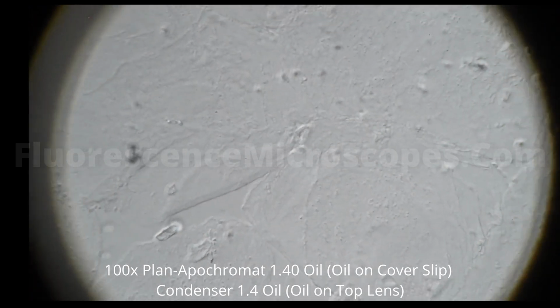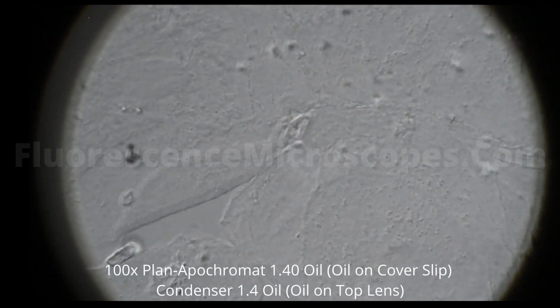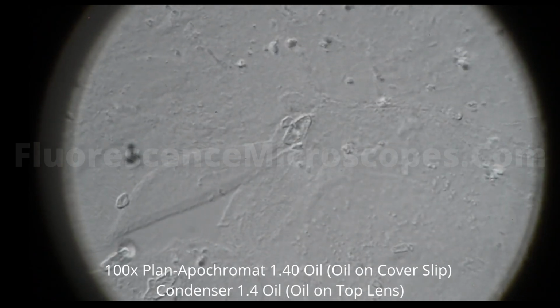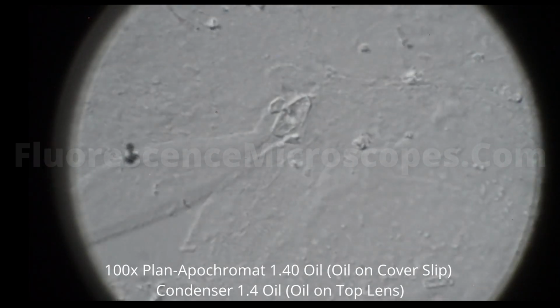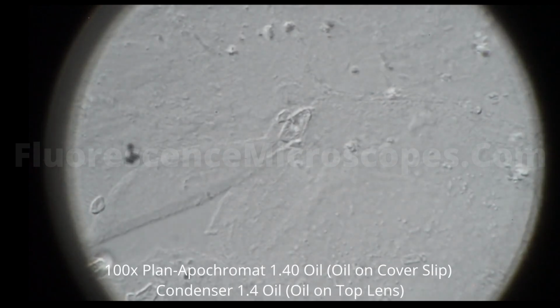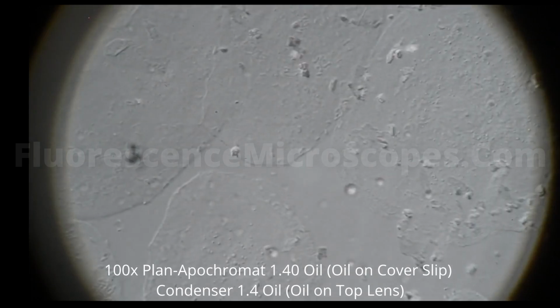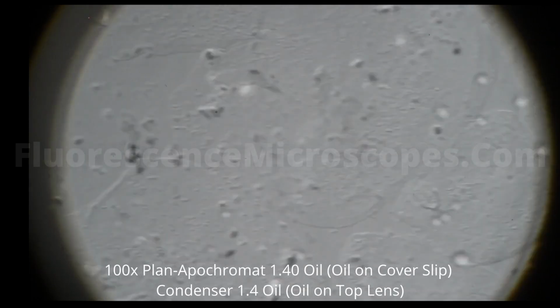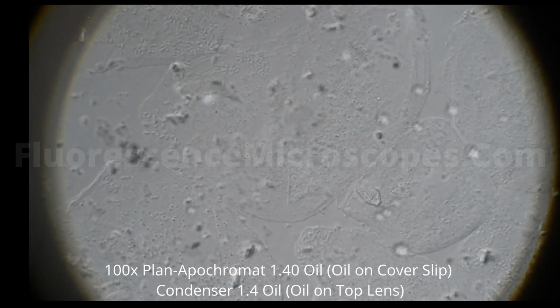Now what I'm going to do, I happen to have a zoom, and I'm going to zoom in. This is an Optivar zoom. And the more we zoom in, the harder it is to get something in focus. This is zoomed all the way out, so this would be considered a 1x on the Optivar.